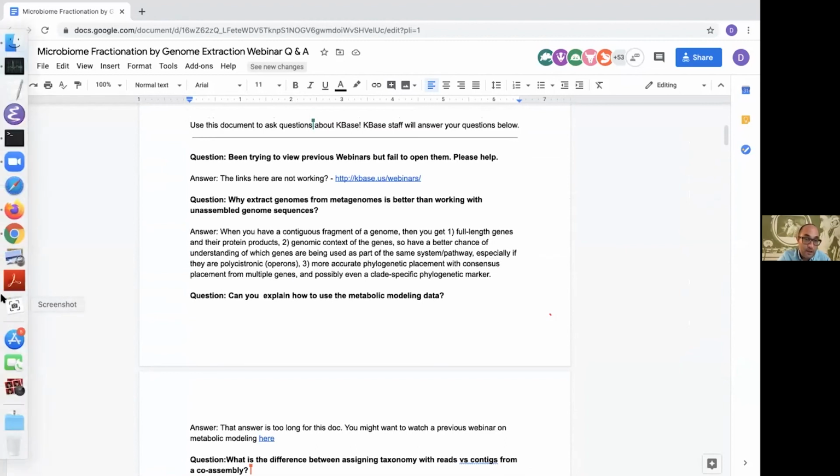I want to thank the whole KBase team, because this tooling that we've built is really on top of the foundation, which is the KBase platform, and that's a really tremendous amount of work and really creative thinking and just wonderful stuff. This platform that a lot of people have built. So this is all just applications built on top of it that happen to be specific to particular bioinformatics questions that Sean and I have. But you can really do quite a lot with KBase that we haven't talked about at all, and will be the topic of other webinars.